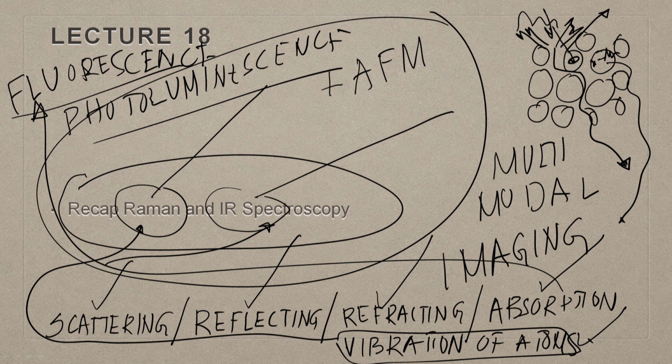All these things are very simple as long as you can close your eyes and visualize, when the light falls on a material, how the material or the atoms alter. Scattering, we talked about that, SNOM.